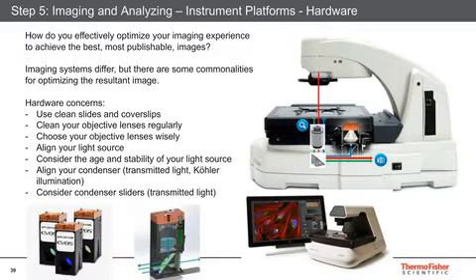And it also uses a light cube. We sell our EVOS light cubes that have an LED lamp built into them. So there's no more aligning of mercury bulbs or having to replace mercury bulbs or discarding the mercury in a safe manner. Now it's built into that filter cube. So you get a nice, even illumination every time without it going bad. It's good for 50,000 hours.